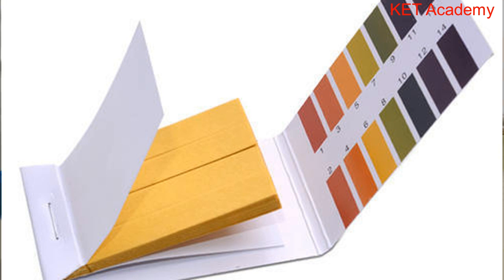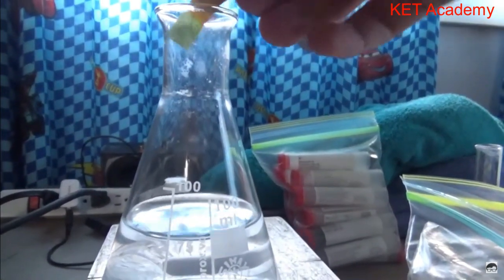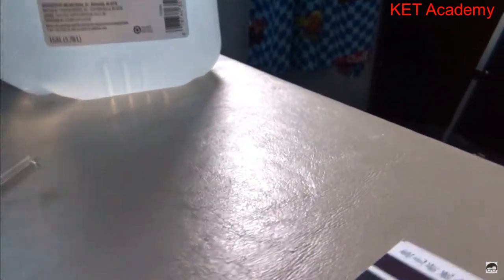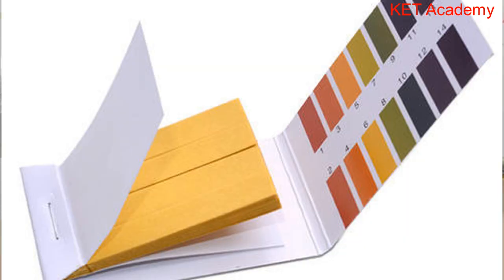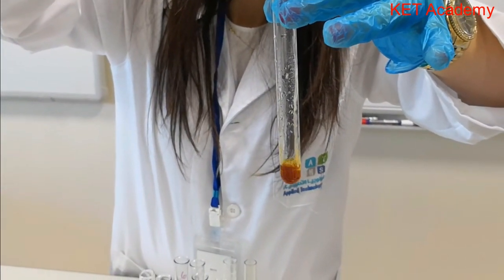We know that you have to dip a pH paper in a solution; this one will likely come. You dip a pH paper in a solution, you look at the color, and you compare it with your pH meter or the paper that will be given to you to compare the colors. From there, you know if it's an acid or a base. If it is red, you know that's an acid. If it is blue, you know that's a base. So you have to be very careful when it comes to that.